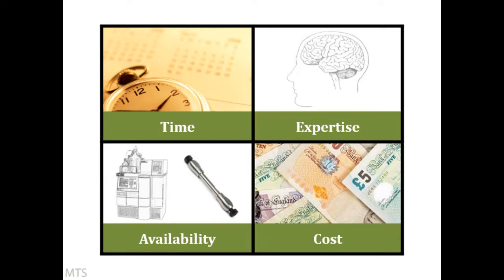And this one I've left to last, expertise, because it depends on where you are in your personal journey of HPLC method development. Have you been doing it for years? Well, then you will try more complicated things. Are you quite new to it? We had a couple of people who hadn't developed methods before. Then you need to think about, right, at the beginning perhaps I'll take it a bit easier. I'll try simpler strategies, and as I build my expertise, then I will build up and look at some of these other options that are out there. So those are just some things.